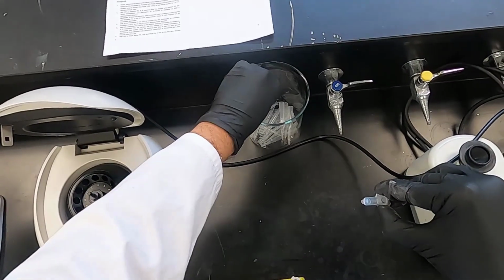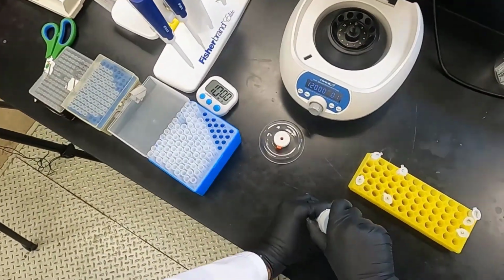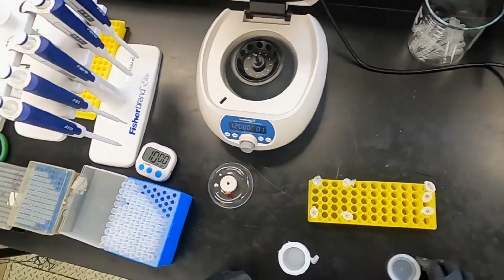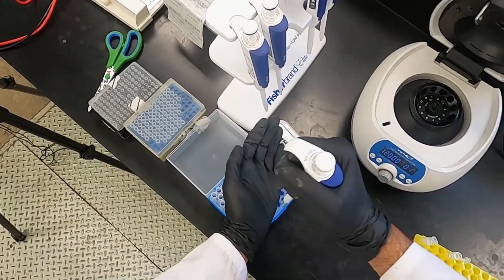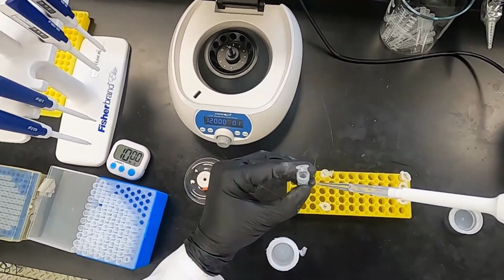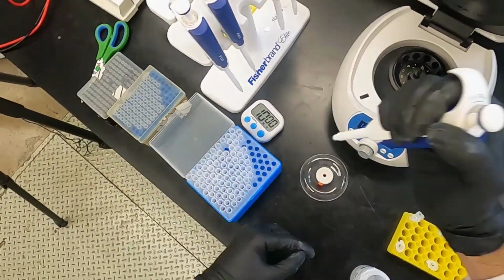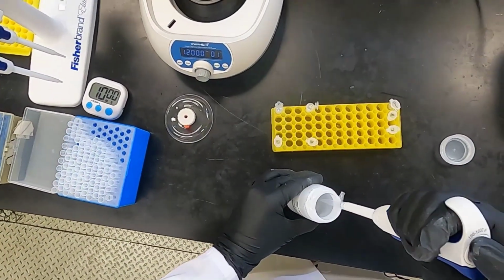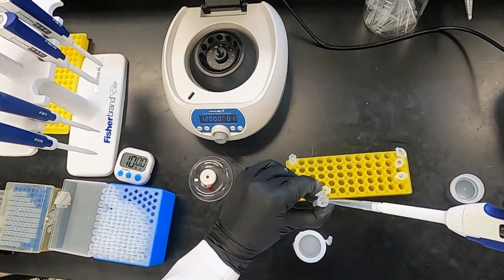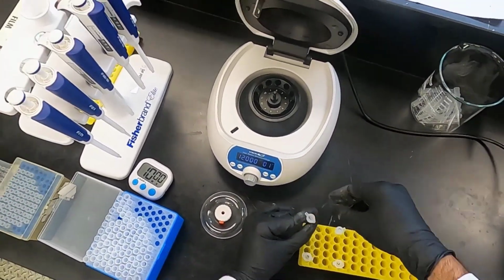So carefully discard. We're going to be using our PE buffer, same as always, same spin conditions, same amount, 500 microliters. Bring these up. And now we're going to spin these once again.